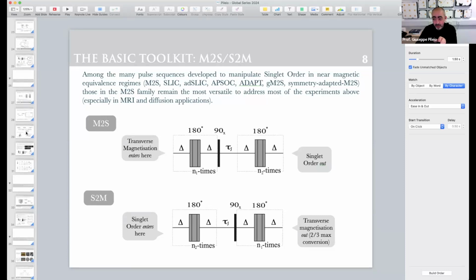I presented that double field machine very quickly, but it wasn't simple to make. It involved Bruker as well to make parts, and lots of issues. So eventually we haven't done it yet. But indeed, I see no problems in coupling those, and we should do it, because your sequences perform better than the M2S you see on the slide now, which is the original M2S.